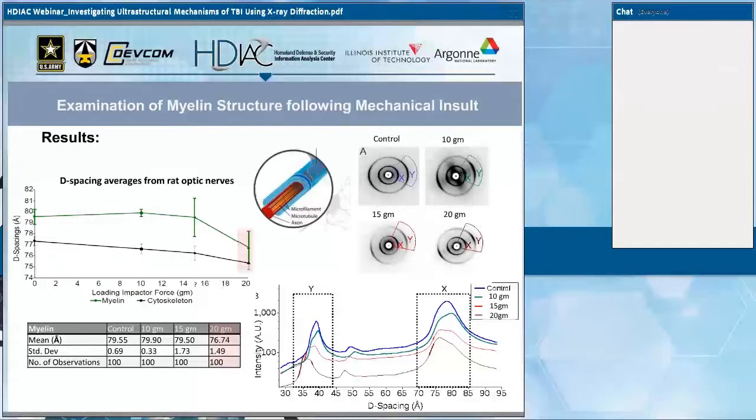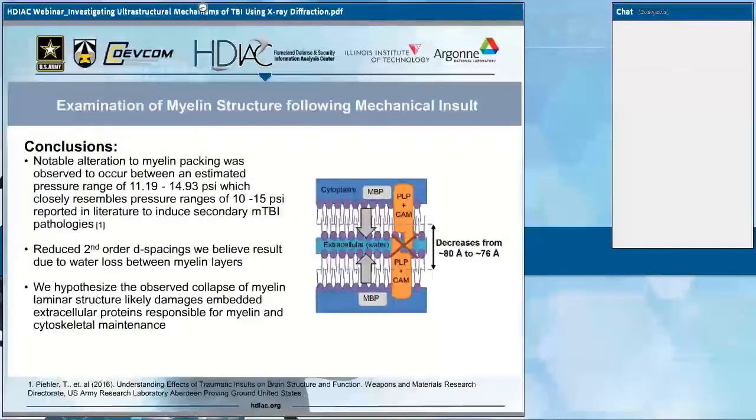And you can see the peaks are shifting downwards, both those diffraction events indicating a reduction in the packing levels, but also you can see that the intensity, so that's the height in arbitrary units on the y-axis, is reducing as well. And that's indicative of the composite crystallites, the fibers as it were, or the packing in this instance, changing direction a little bit and also becoming much less coherent.